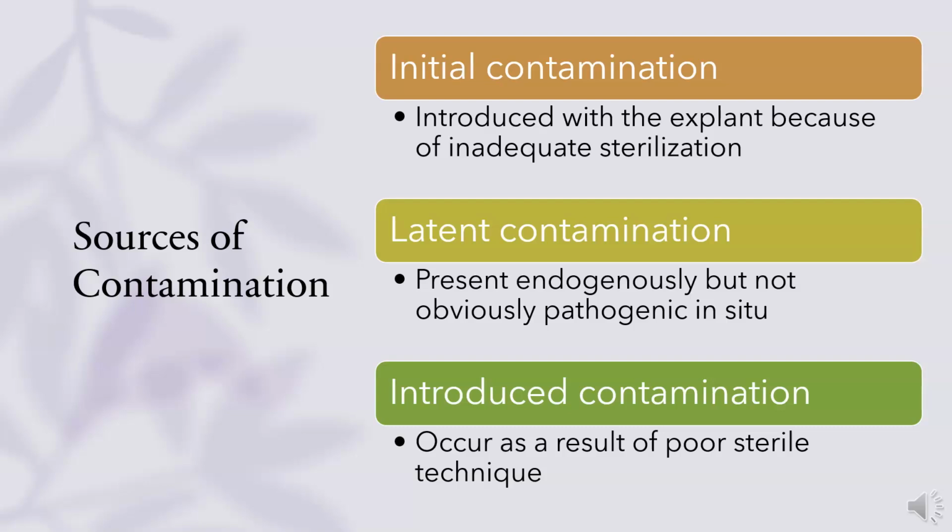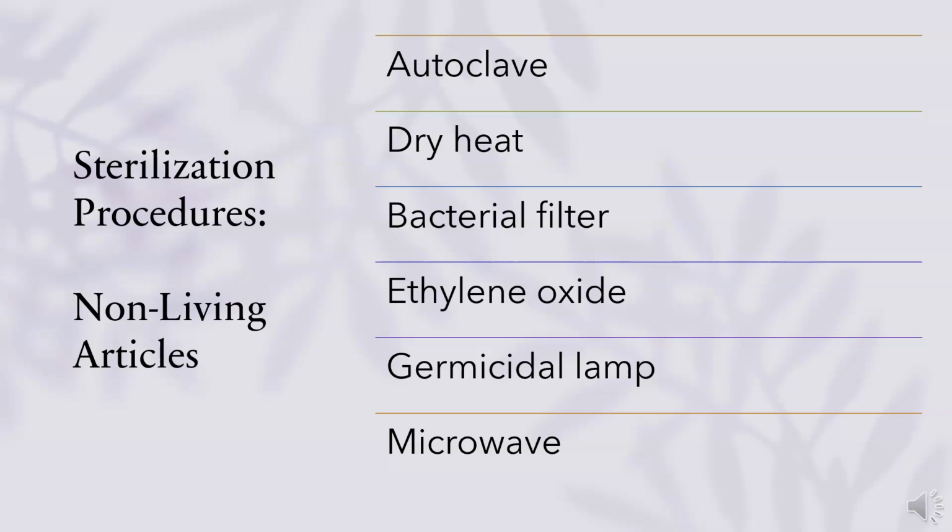Contamination can also result from poor sterile technique, or dirty laboratory conditions. This type of contamination is largely preventable with proper care. Whether it is labware, culture medium, plant material, or instruments used in the laboratory, all are sources of infection and need to be sterilized.